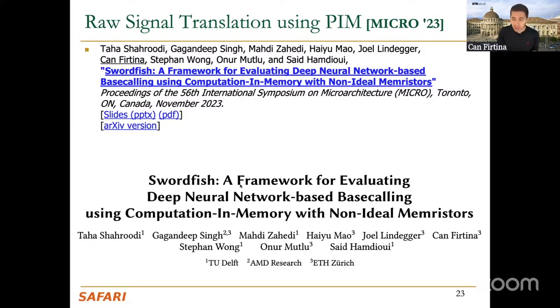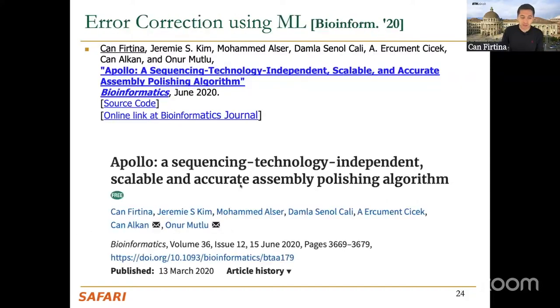And what we show is that we can do computation inside the memory to do these multiplications so that we can even do basecalling. So this is another interesting work. If you are interested, you can take a look at this.